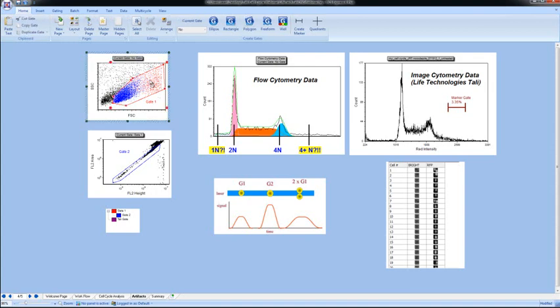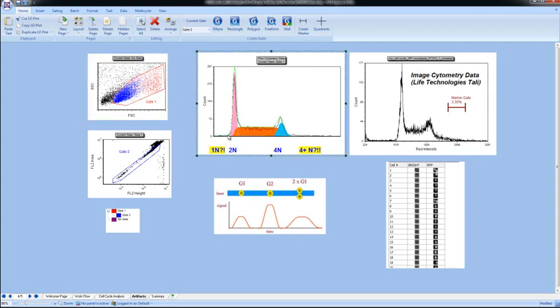So what we do in flow cytometry is set a gate on what we know to be cells in our analysis based on the size and shape of them. And if we apply this gate to our flow cytometry data, notice how we're going to lose this population here, because now we're only looking at the cells we know that are actual intact whole cells for the analysis.